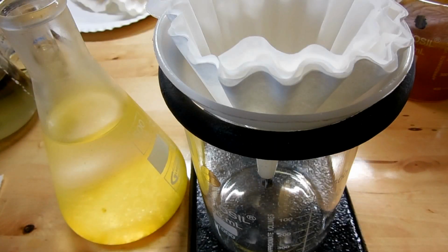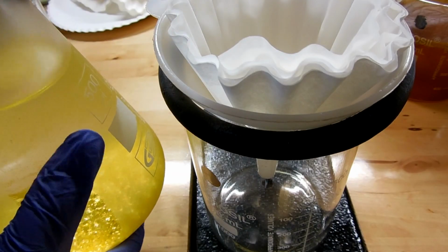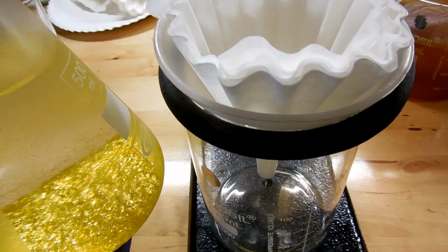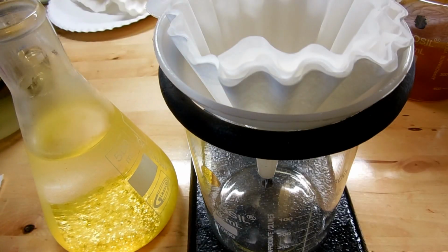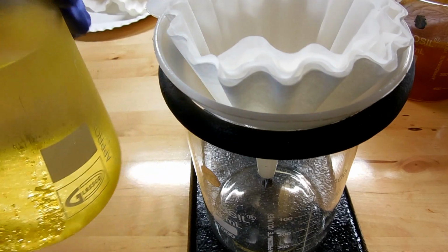All right, I placed the solution in the fridge overnight, and we can see that there's still the gorgeous gold-colored lead iodide flakes. But they still look beautiful. So what I'm going to do is try to filter this off now. I suspect that the flakes aren't really going to survive this because they're so very thin. I imagine they'll be pretty fragile, but we'll see what happens.